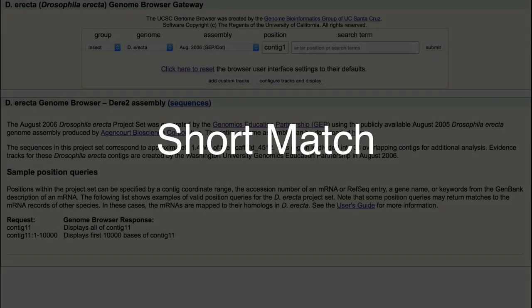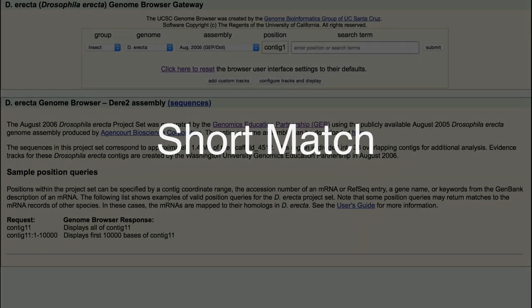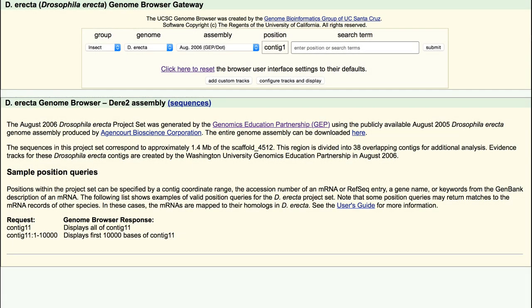Here we will use the Short Match functionality in the UCSC Genome Browser to find a short sequence motif within our contig.